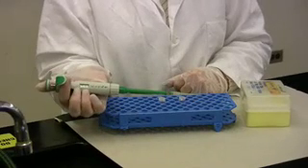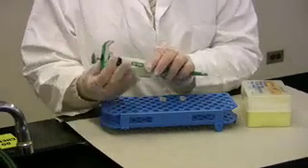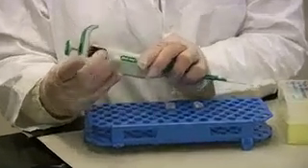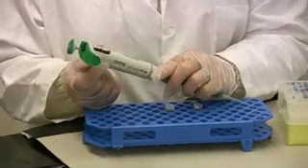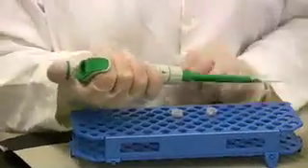The next thing I want to do is to turn the adjustment knob until I have actually reached 100 microliters. As you can see, I am now at 100 microliters.